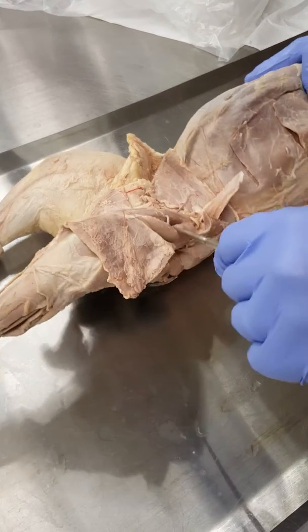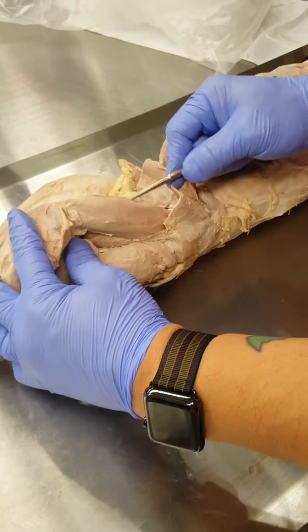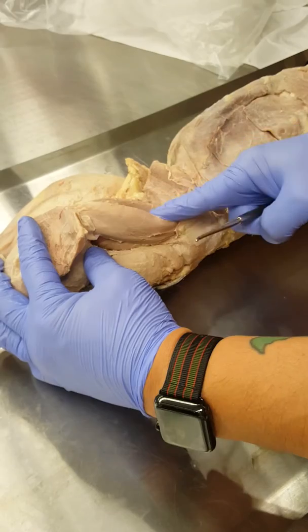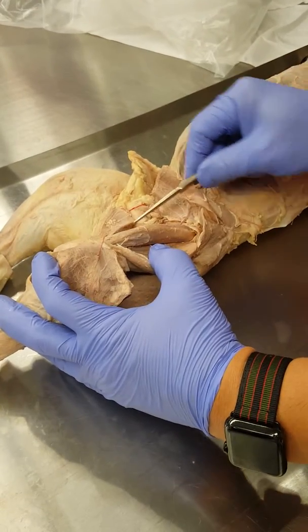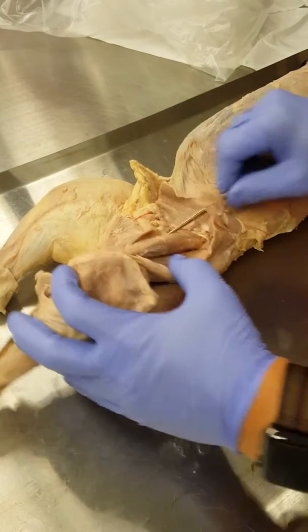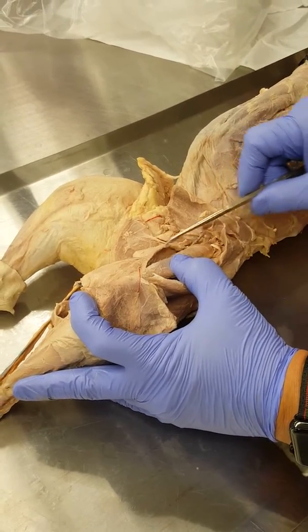So this big muscle on the side, right here, this whole thing, that's vastus lateralis. Big muscle, vastus lateralis. And then in the middle, there's the straight muscle. There's the rectus femoris right there. And then on the medial side, this is the vastus medialis right there.